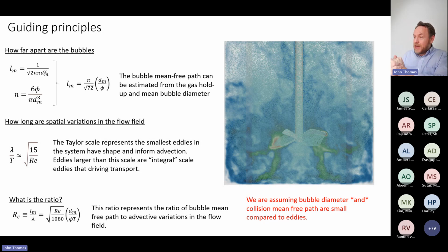So I'm going to get into the theory here, but I understand that this is a little bit conceptual, or I should say, a little bit rarefied. First question is this: if we're going between this discrete versus a diffuse versus ballistic approach, how far apart are the bubbles? Like, how far apart are these bubbles? That's something we can estimate from kinetic theory.